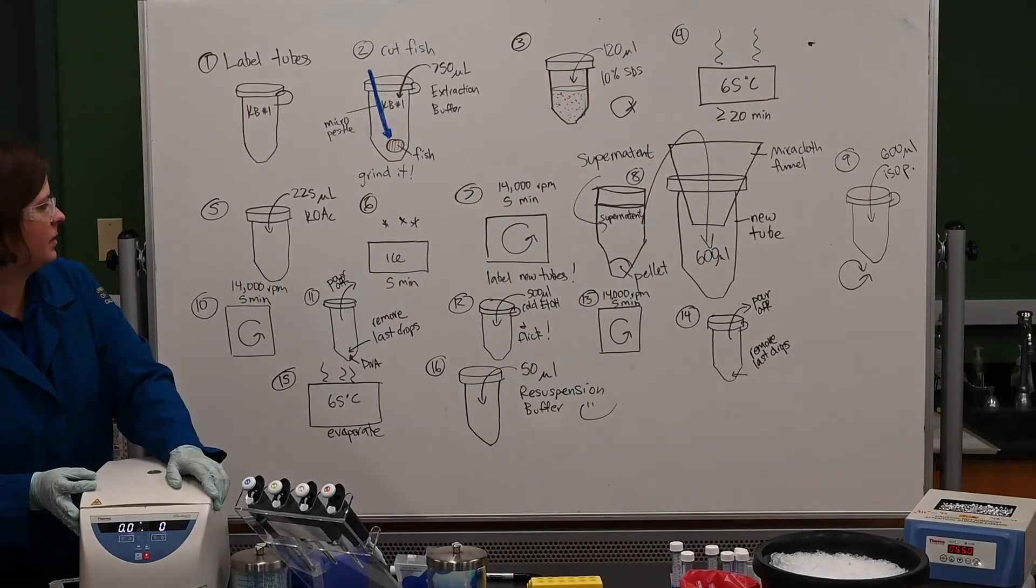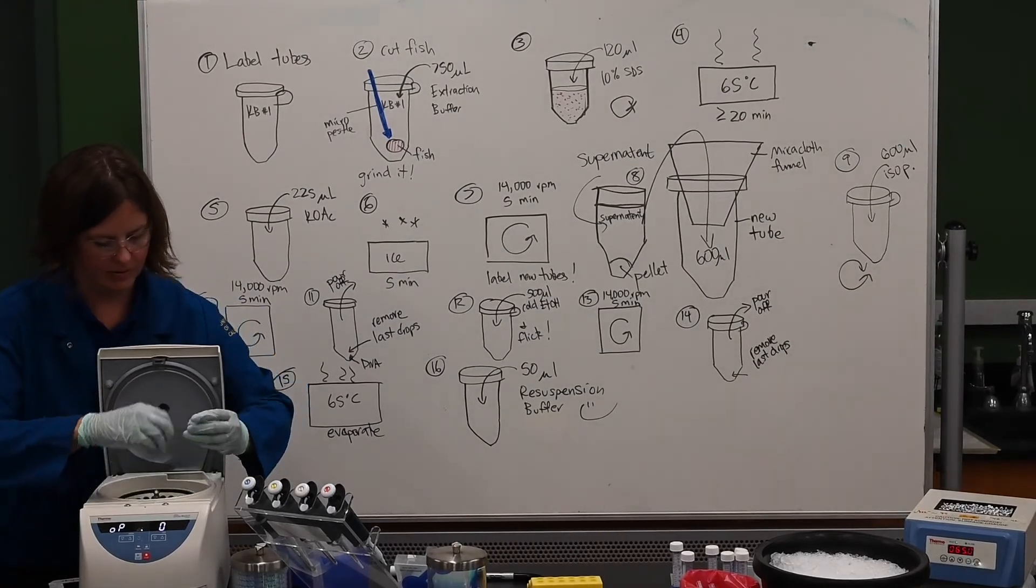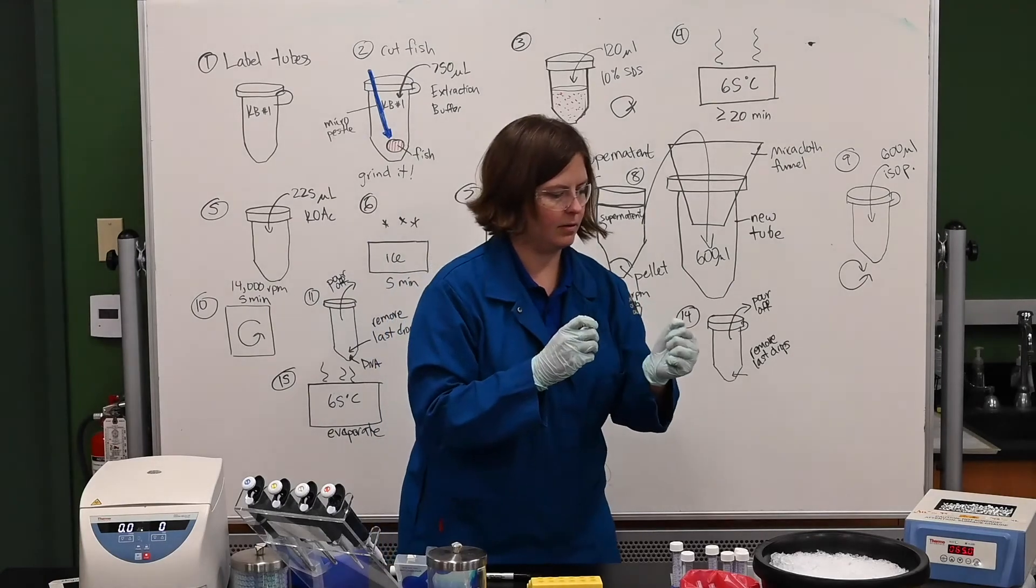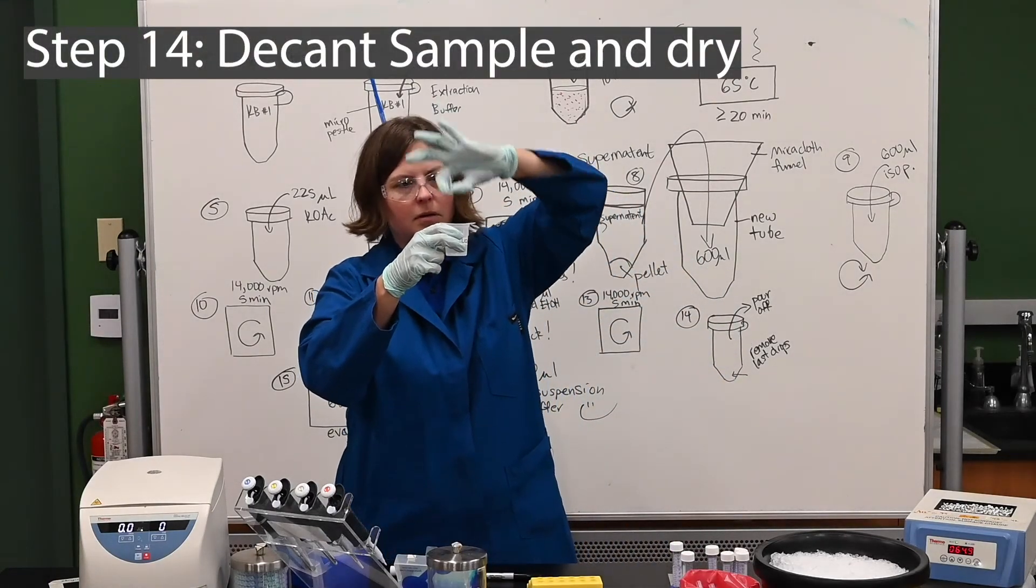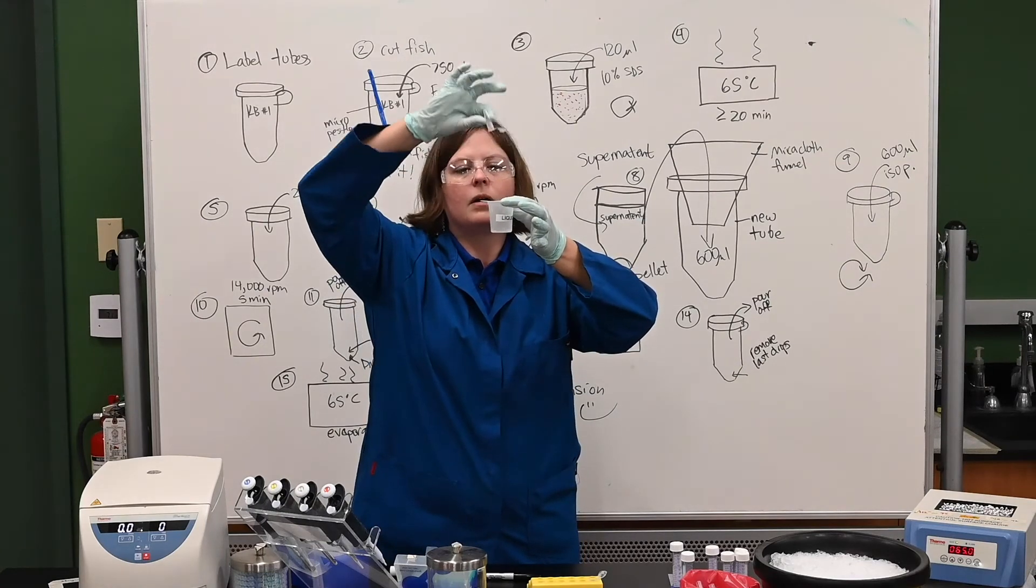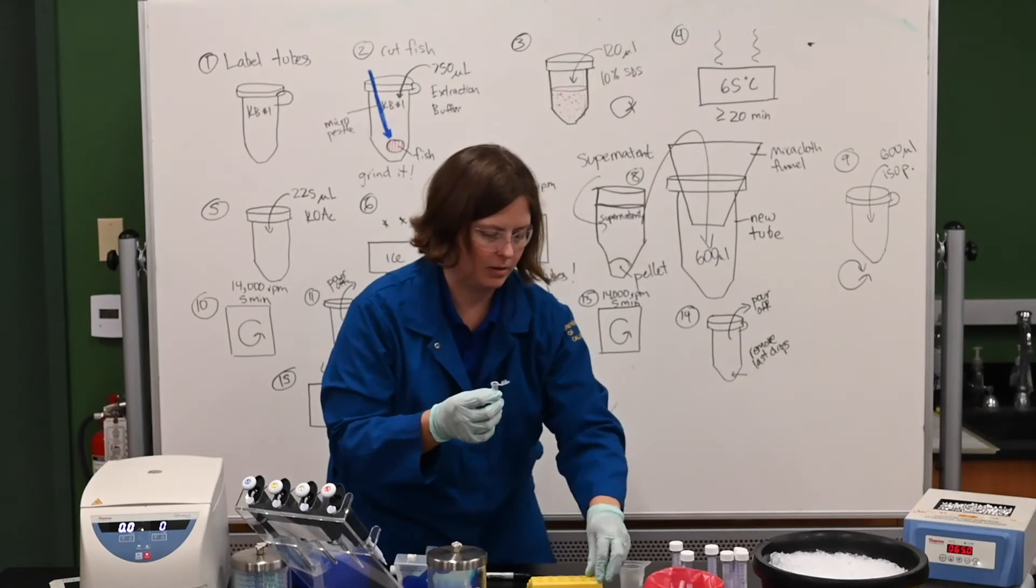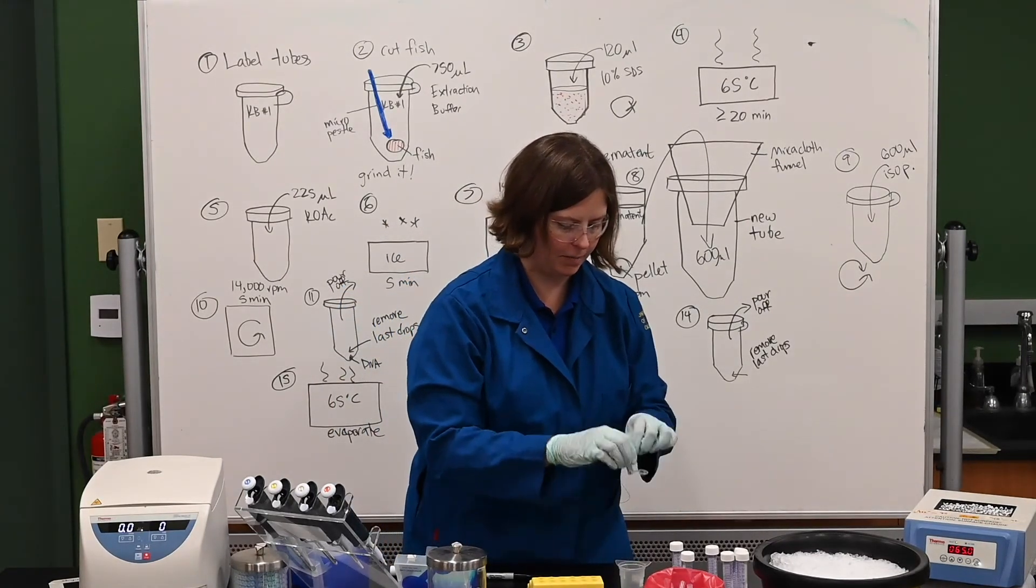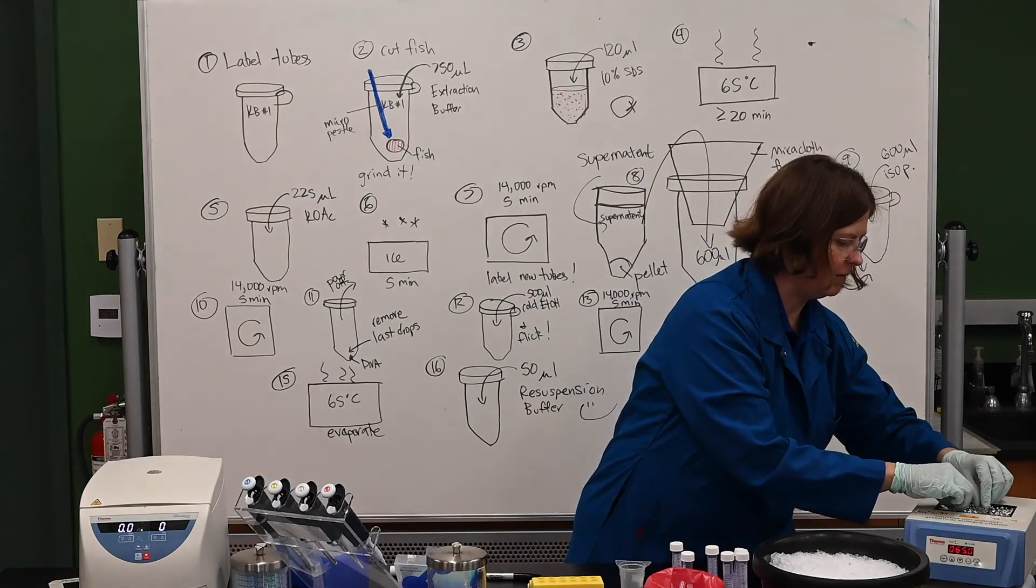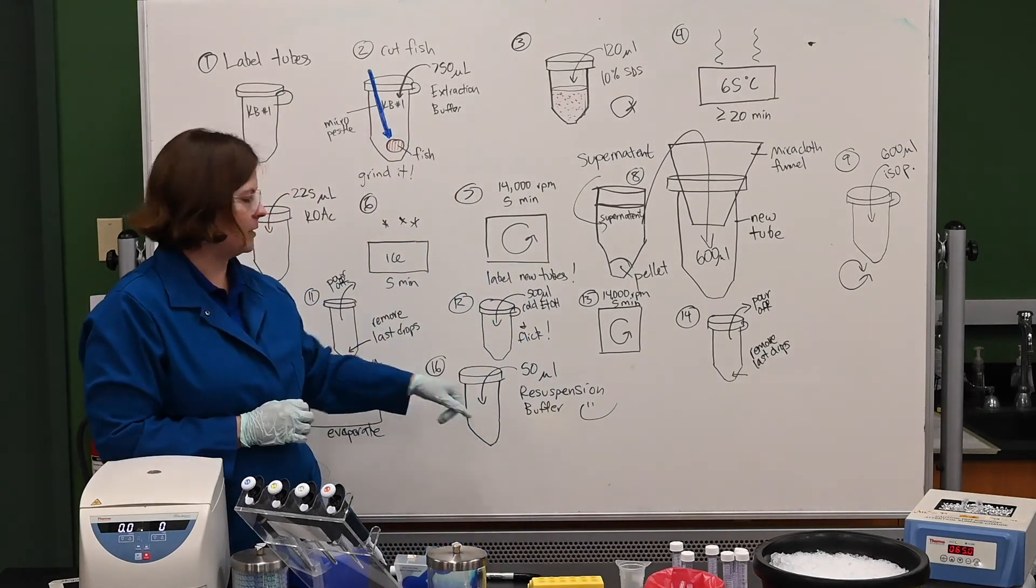Now we're on step 13, now we're on step 14. I take these out and I'm going to pour off the liquid, put them in the heat block. Again, this is a scary step where it's like, oh, DNA is still there. And the reason I've got these different little, like this is for my liquid trash, this is for my solid waste, standard lab safety procedures. We have to keep these separated because we have to handle them differently when we throw them away. Let that evaporate. And when I'm certain that there's no ethanol left in those tubes and it's completely dry, I'm going to add this resuspension buffer liquid. That's it.